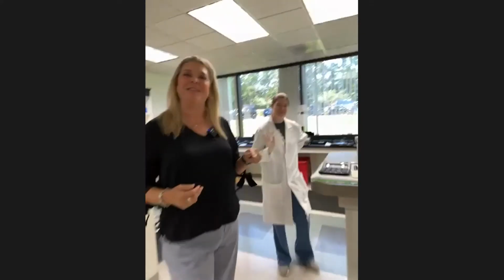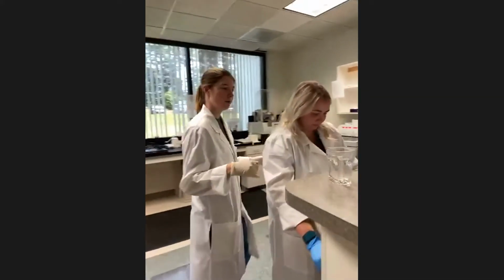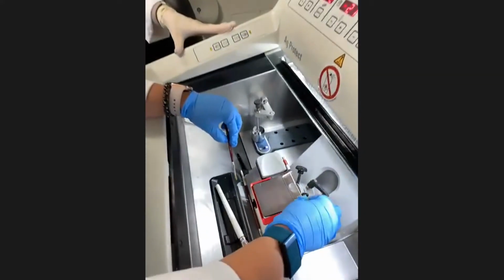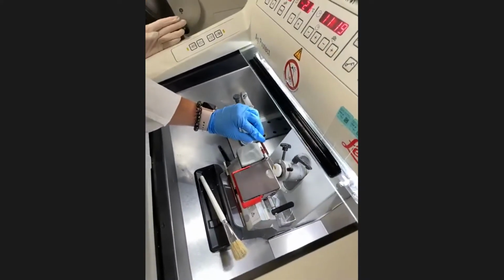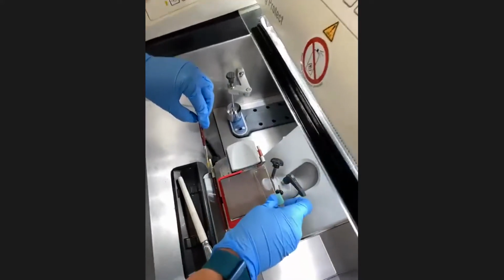So let me introduce you to Beth and to Caitlin. They're going to help us out and tell us a little bit about immunofluorescence. Okay, if you want to come around here, Caitlin here is cutting on what we call a cryostat, and she's cutting a case here. She's taken her bottom sections, and now she's working on her second row, her top sections, and she rolls off every section one at a time. And then she's putting cryomatrix on the slide.